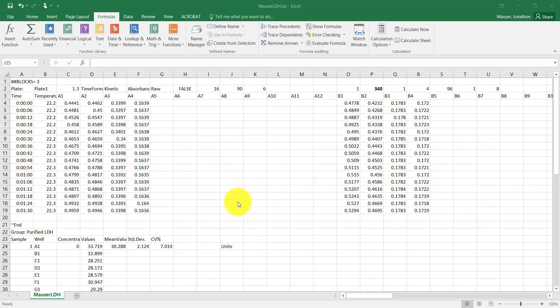By the end of this you should know how to process your data and how to get it in an activity unit, which is in terms of what we call units per mil.